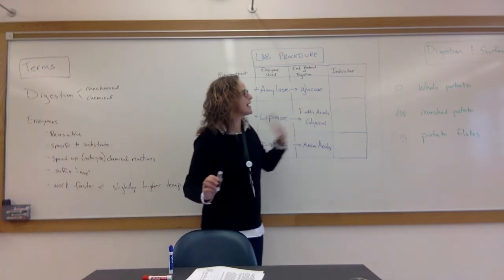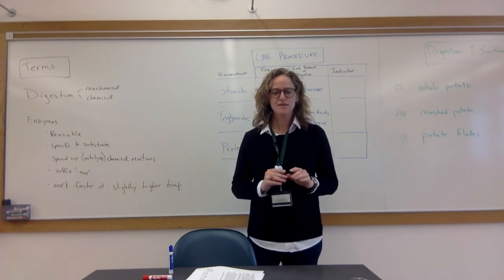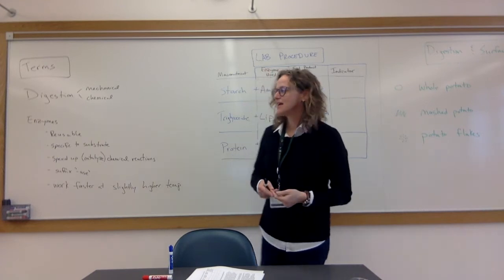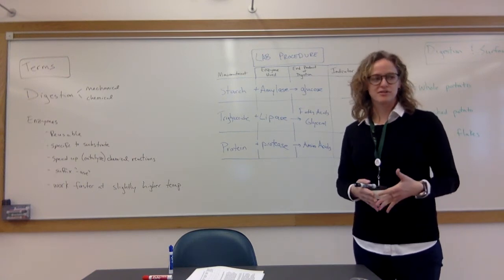On the far to my left, your right, is the indicator solution. You do not have to know these specifically, but I want to remind you of what an indicator solution does. An indicator solution changes color to tell us whether or not something is present.